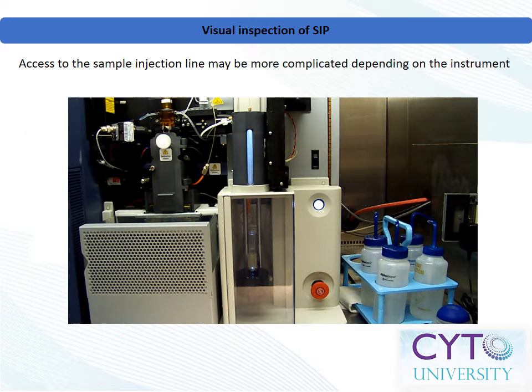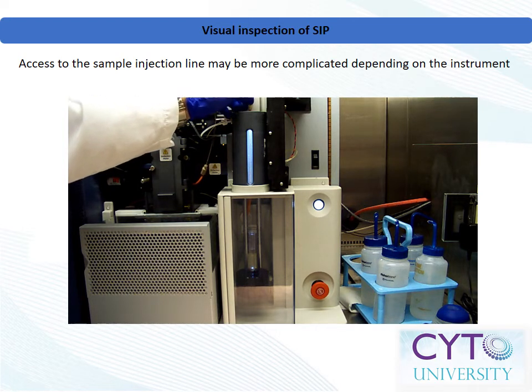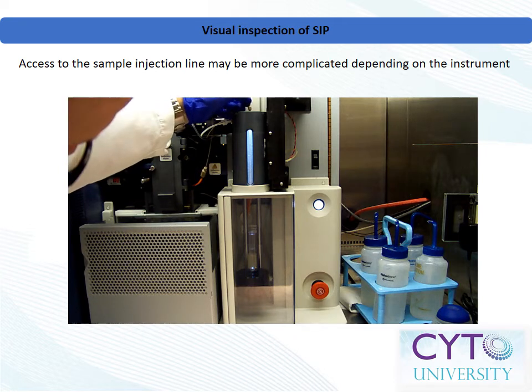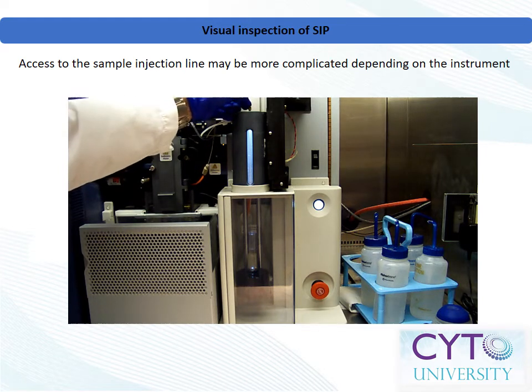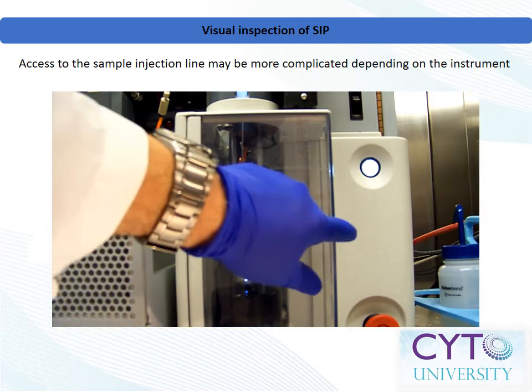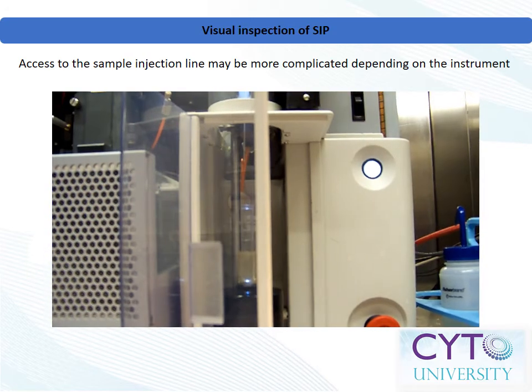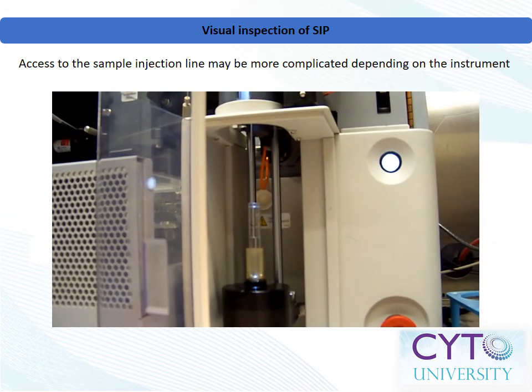On certain systems, the sample injection tube is enclosed within a bulk injection chamber. The sample injection tube can be accessed and cleaned using the change sample filter command within the software. When prompted, drop the sample line below the lower edge of the bulk injection chamber in order to gain access. Once the sample line is below the lower edge of the bulk injection chamber, it can be cleaned as needed.